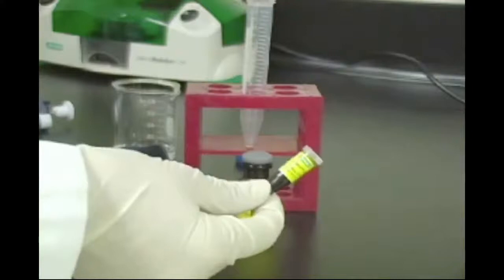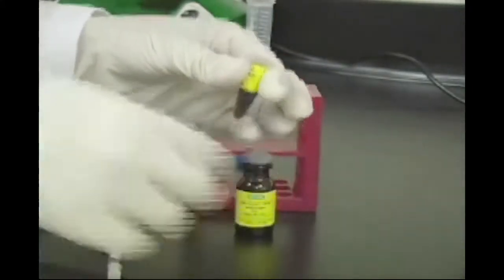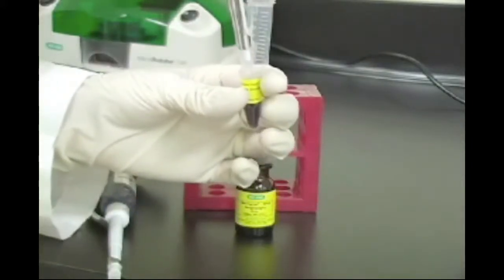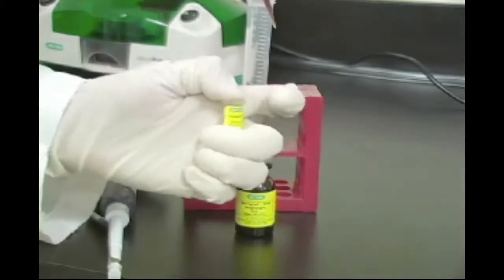Prepare your protein sample. See the manual for recommendations on the appropriate preparation of your sample. In this video, we will be using the protein sample from the Microrotifor Starter Kit. It contains three naturally colored proteins in deionized water.